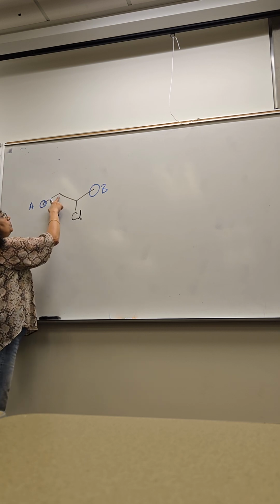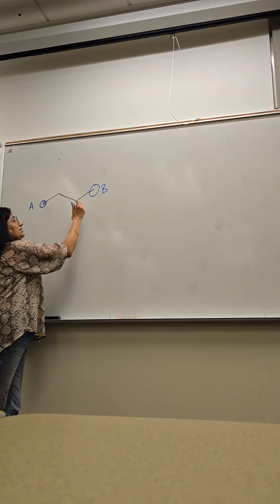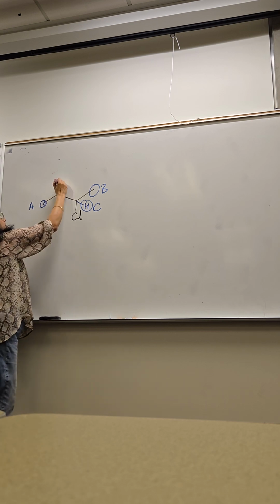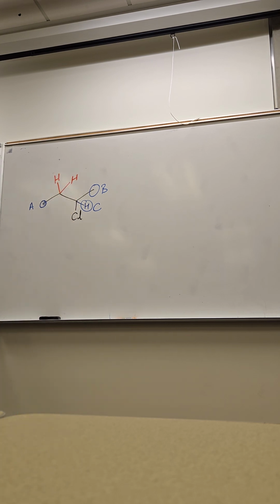CH2. Those two? Can I take that last one? Sure. That one is unique. There's nobody like it. Agreed? Now I want to pause on these. There are two hydrogens, absolutely. That's a methylene group. Two hydrogens, but are they identical? They're not. They're different. How so? So, let's bring some three-dimensional perspective to this discussion.